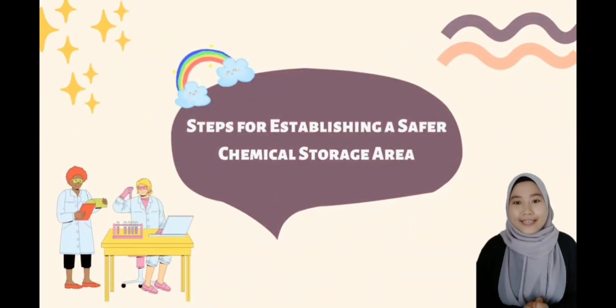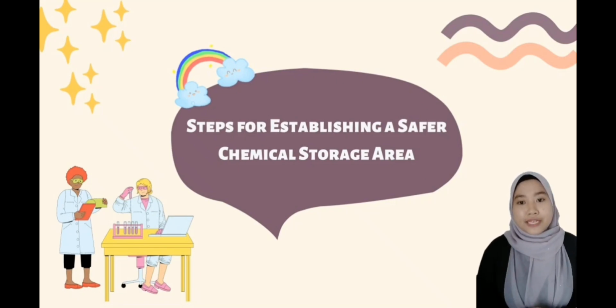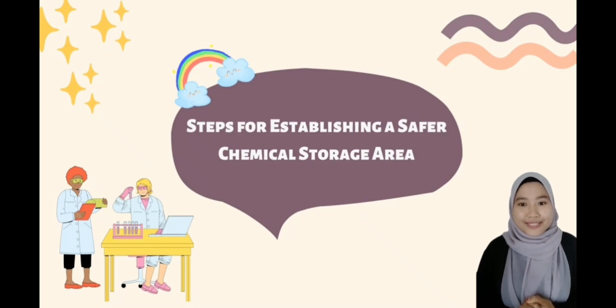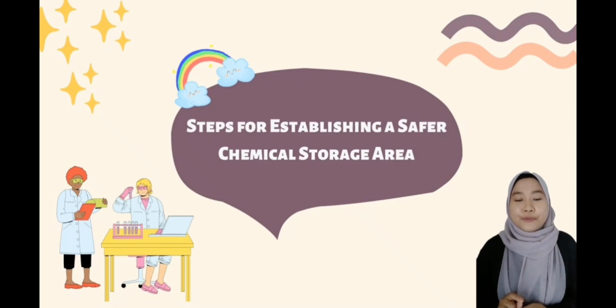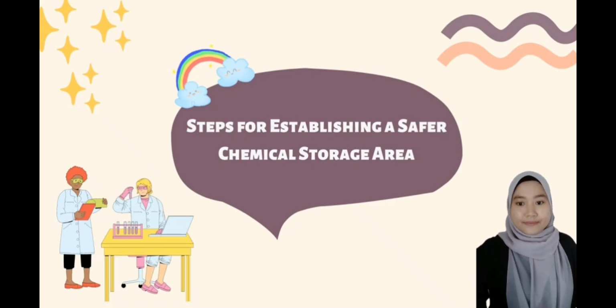Hi, I'm Husni Hidayah. For the next topic, I will talk about steps for establishing a safer chemical storage area. The safe storage of hazardous chemicals is an essential part of laboratory safety. There are regulations, requirements, and best practices that can guide us to have a safer chemical storage area. This is necessary to avoid chemical harm to people, property, other substances, or the environment.